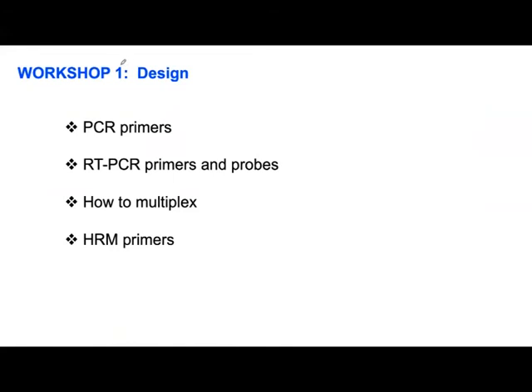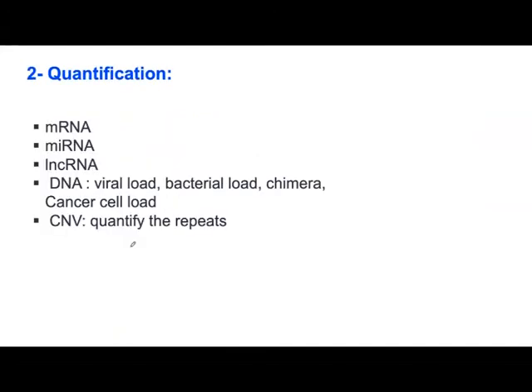So that's why the second workshop, sorry, okay, this was workshop number 1, as I told you, where we're going to describe how to design primers, multiplex, and also how you specifically design primers for HRM. There are certain rules for HRM. So this will be the topic of workshop number 1.